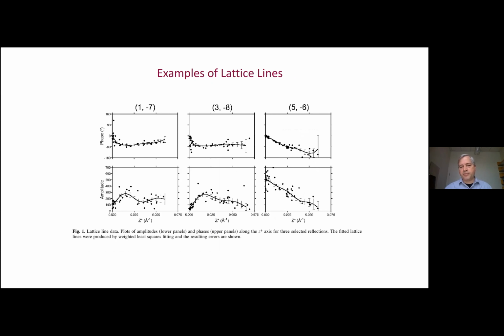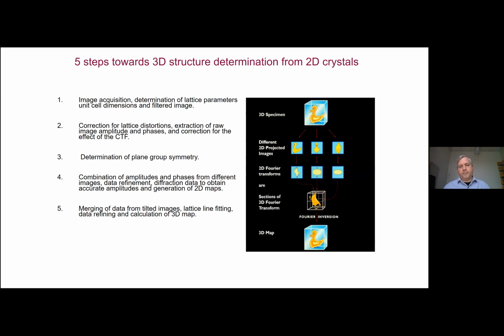But merging all that was also difficult because you can't suddenly tilt too high. You have to work your way up from 0 degrees because you have to still figure out what is what and how to line things up in order to merge all of the data.